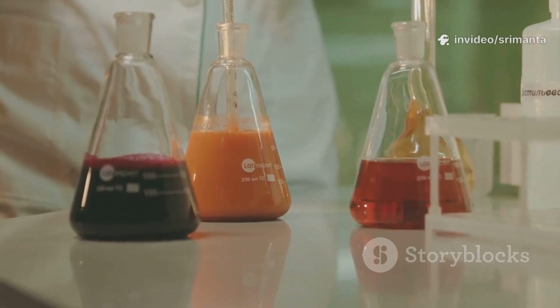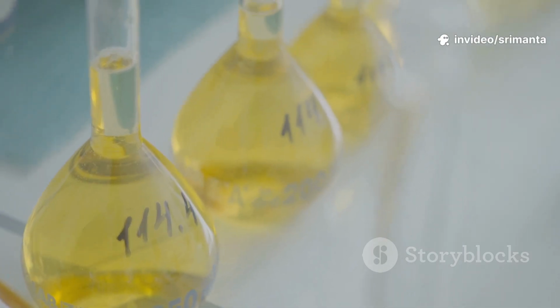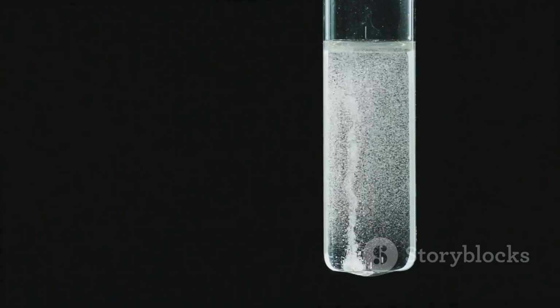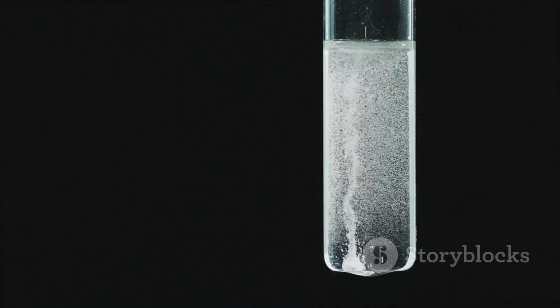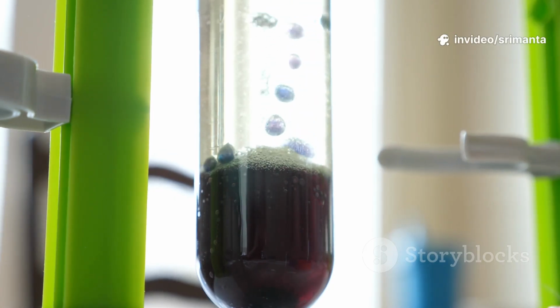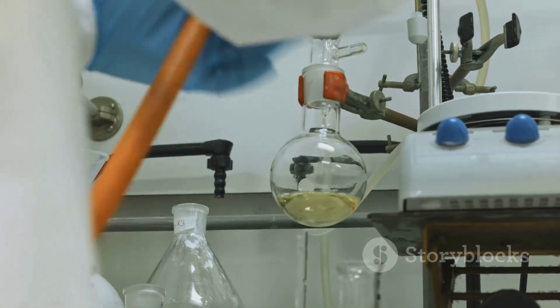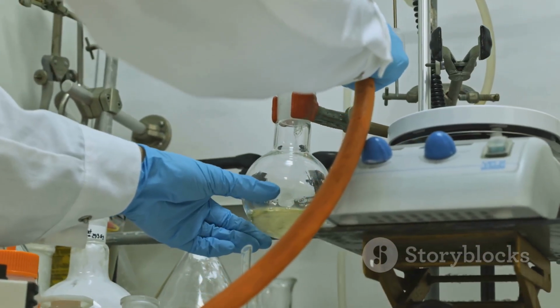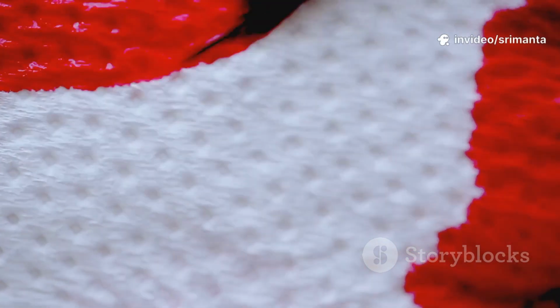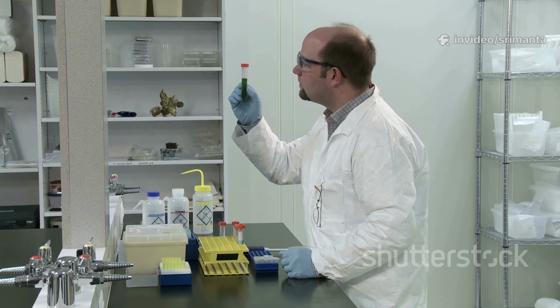Once both bottles are prepared, the reactions begin. We let both setups sit for a specific amount of time, usually around 40 minutes. During this time, the zinc reacts with the acid in both bottles to produce hydrogen gas. This hydrogen, in turn, reacts with any arsenic present to form arsine gas. The gas travels up the tubes, past the lead acetate cotton filters, and finally reaches the mercuric chloride papers at the top. As the arsine gas from each bottle hits its paper, a stain begins to form. We wait patiently, letting chemistry do its work and create the visual evidence we need.